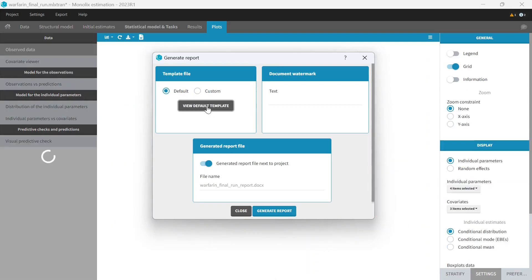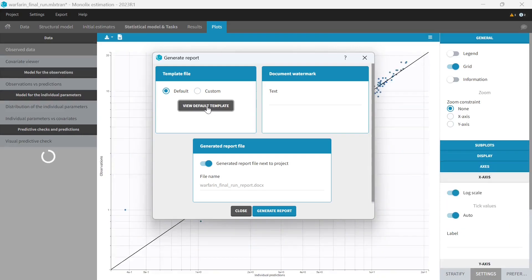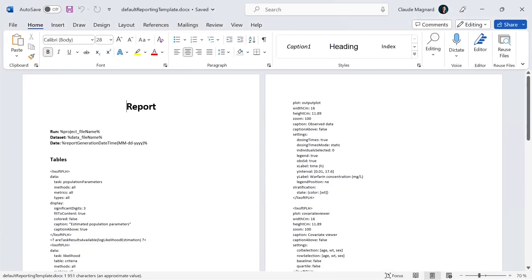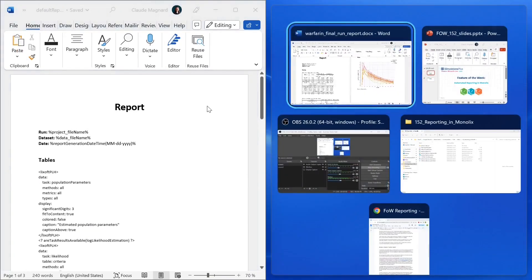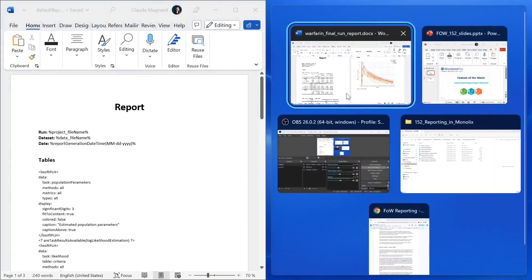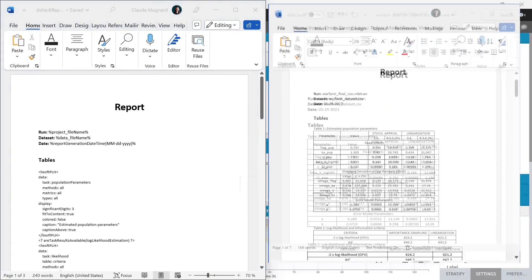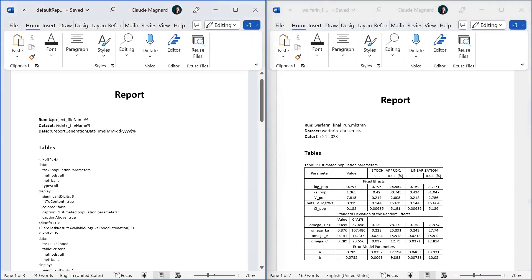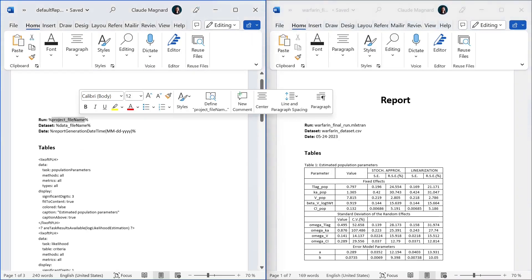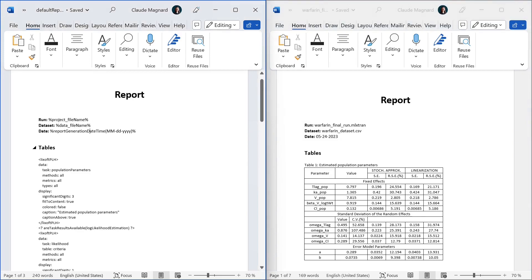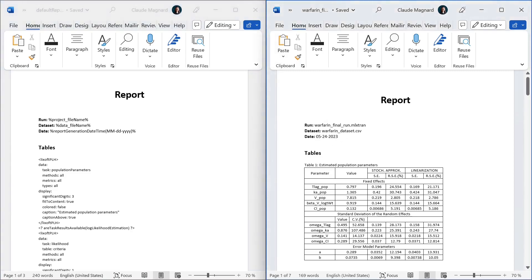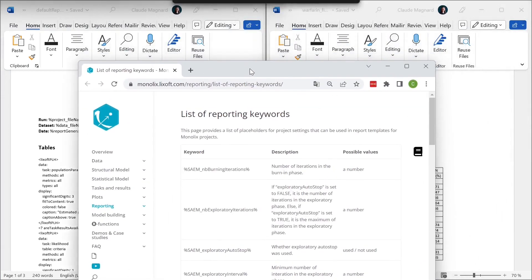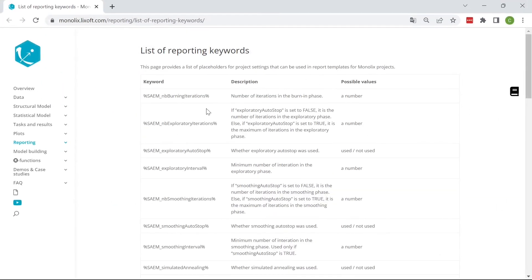This is the template file used by Monolix to generate the default report for this project. Let me display this template on the left and the report we obtained on the right. First, we see keywords surrounded by percentage signs. These keywords have been replaced by their value for the current project and today's date. To use keywords in a custom template, you can refer to the list of reporting keywords available on Monolix website.